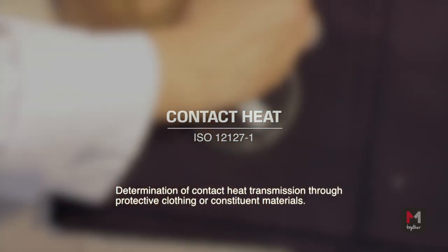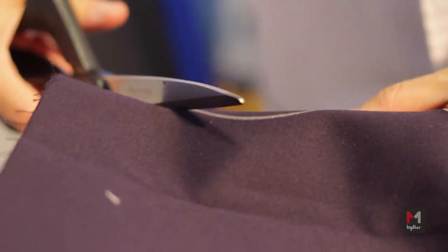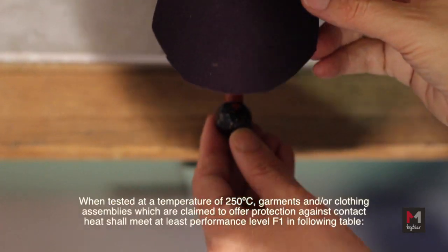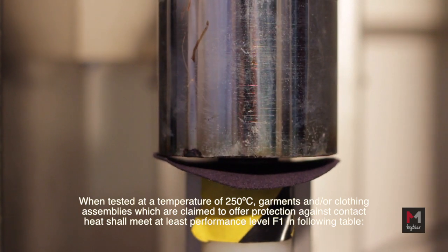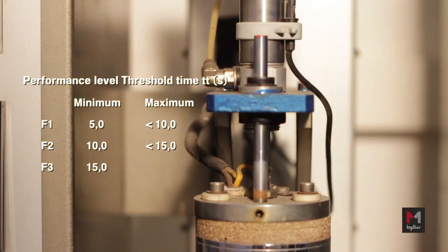Contact Heat: The fabric specimen is placed over a heated metal cylinder at 250 degrees Celsius. On the other side of the fabric there is a calorimeter that measures the temperature rise. The time of the calorimeter to increase 10 degrees Celsius is calculated.